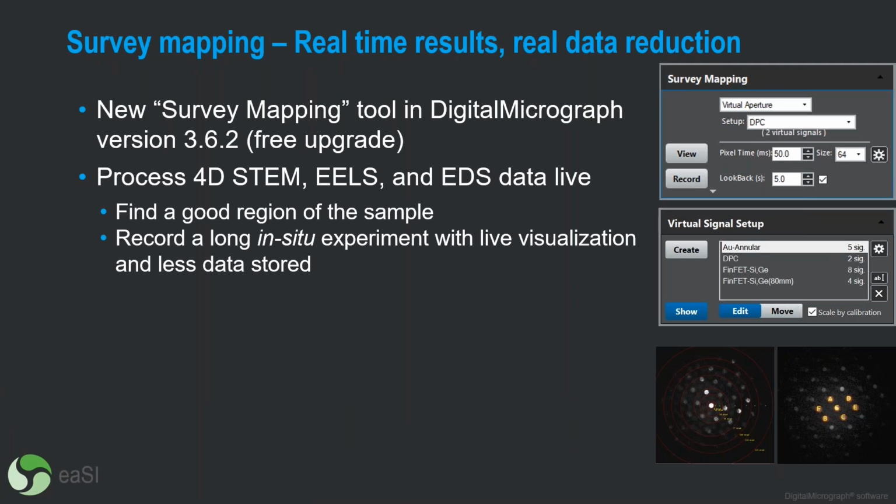You can use this tool to process 4D STEM data, which is the focus of this webinar, but you can also use this same tool to process EELS data or EDS data live. And again, there are two main ways that I see people using this tool.